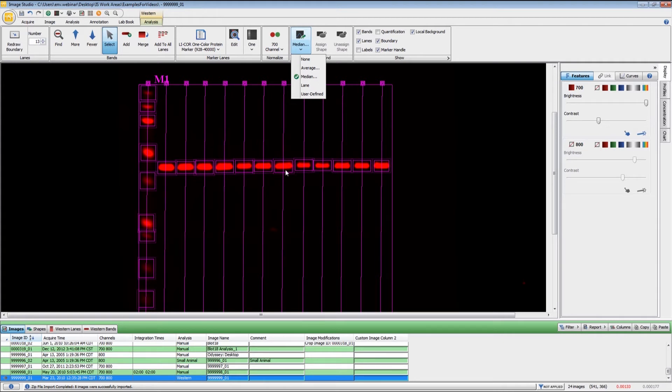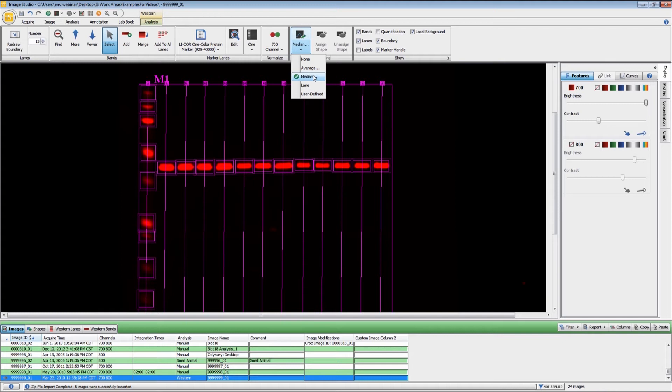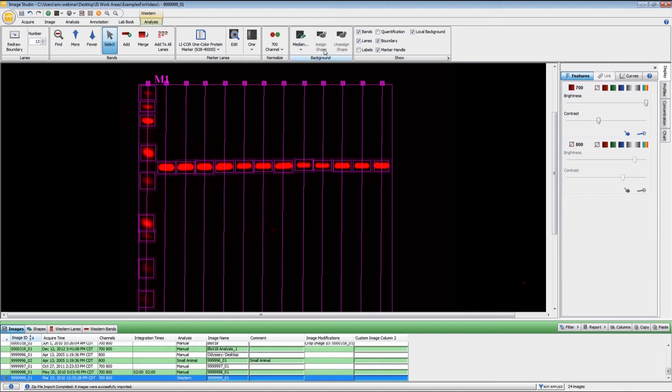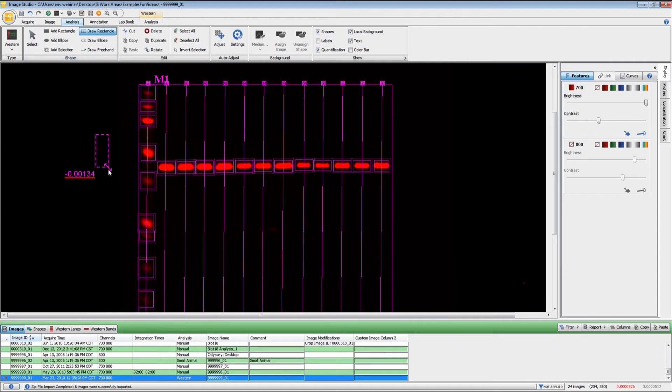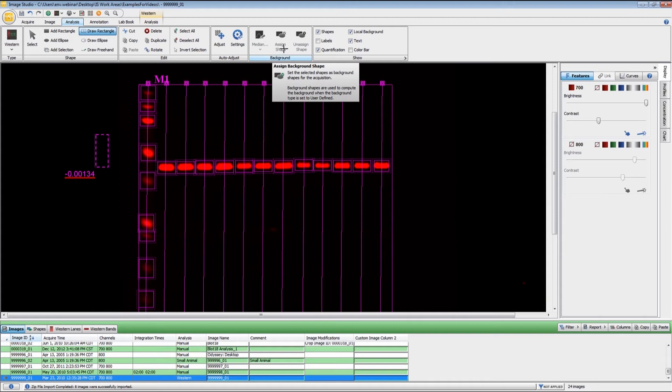Or you can use what we would call a local background, either average or median. With this, you can set the width of the background area anywhere from one to five pixels. You can also choose whether you want to use all sides of the box around the band, whether you want to use the top and bottom or the right and left. If you have an antibody such as a phosphotyrosine antibody, or just one that gives you a lot of nonspecific bands, using either the average or median is probably your better choice. You can also set a user defined background by drawing a rectangle somewhere and setting that as your background shape.